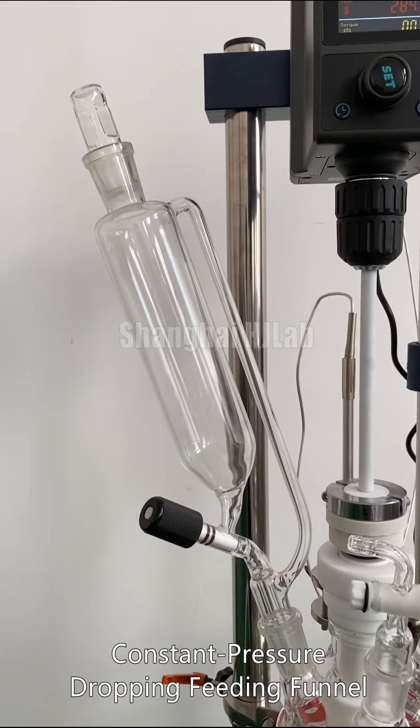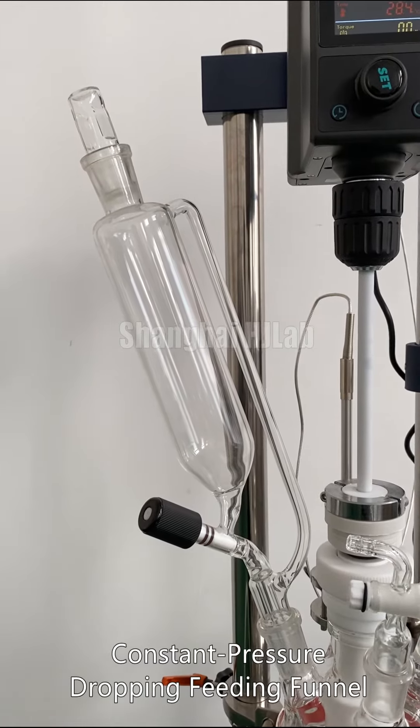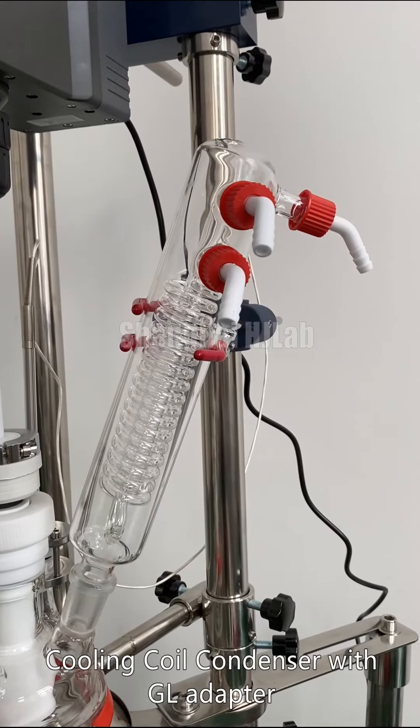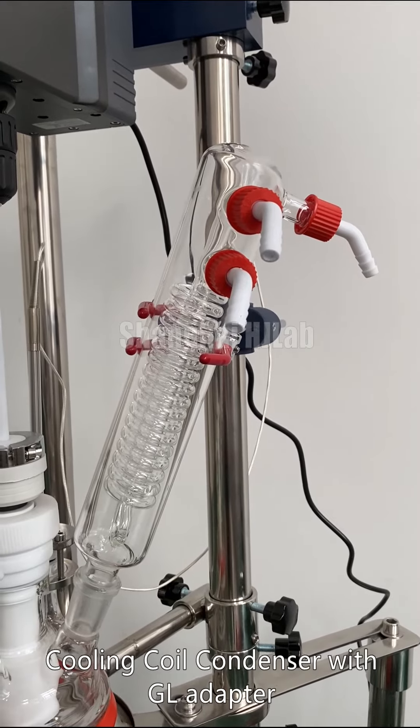Constant pressure dropping feeding funnel. Cooling coil condenser with GL adapter.